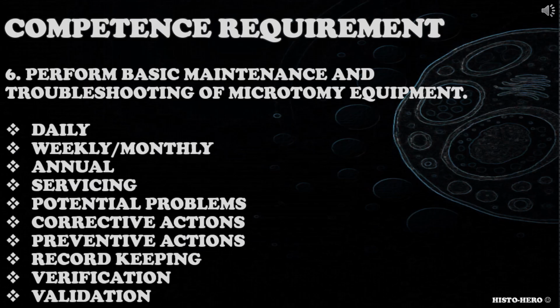When addressing this competence requirement, candidate could consider daily, weekly, monthly and annual maintenance, need for servicing, potential sources of problems with equipment, corrective and preventive actions that can be introduced to prevent problems, record keeping, verification, validation and so on.